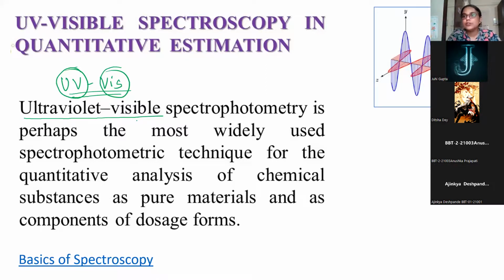If you see a spectrophotometer written as UV vis spectrophotometer, it means it can give you both UV light and visible light. So you can read amino acids, nucleic acids like DNA. DNA concentration also comes in the UV range. If you extract DNA from a bacteria or from a plant, and now you want to know the concentration of DNA, you have a nano drop also nowadays in laboratories. I don't know whether DY Patil has a nano drop or not. All you have to do is put a drop of your DNA sample and put the probe on it, and you will immediately get the concentration.